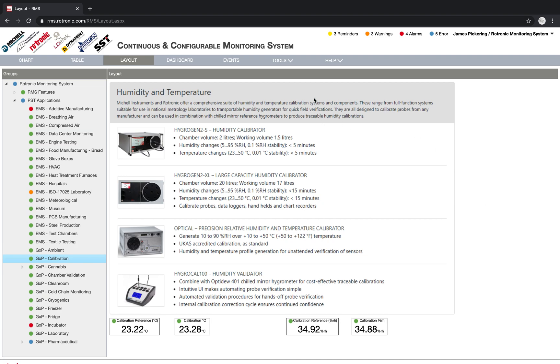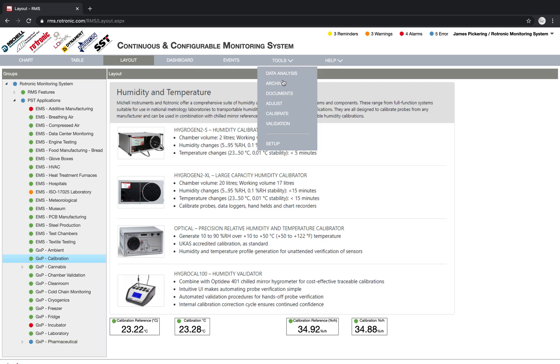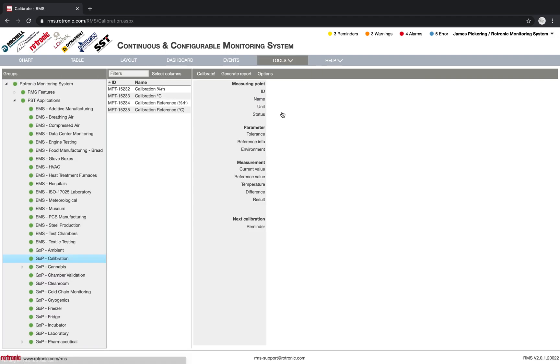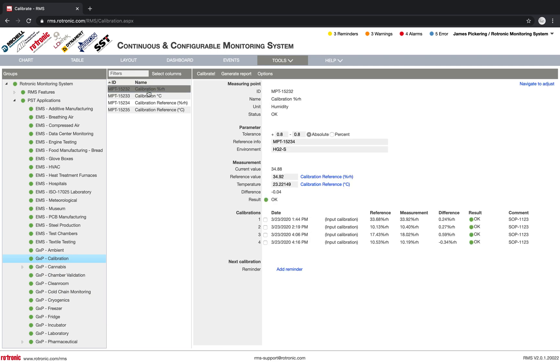So within RMS, we have tools and we have a calibration function. Under the calibration, I see here, for example, my relative humidity points. As you can see yesterday, I carried out a few calibrations down here and the results are all okay. So let's quickly go through. First of all, we see the measuring point ID. We see the name of the calibration point. We see the unit. What are we measuring? And we see the status of it's okay.